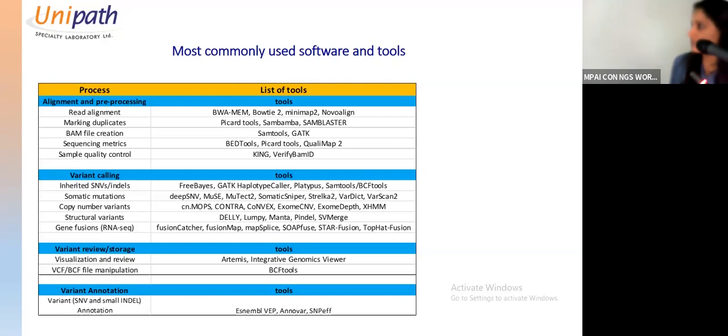Right, and this is for annotation. This is really important, as I said. You get the gene address from the VCF file, but how do you get the variant details? You get that only with annotation, right? So these are the tools which help in annotation. VEP is widely used, and you can use it; it is one of the best tools.